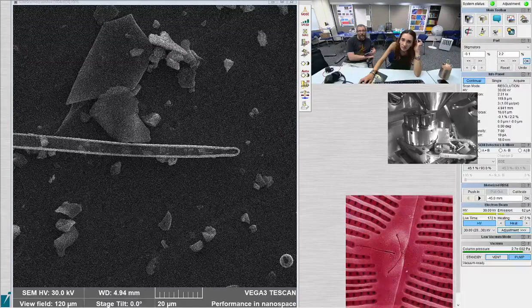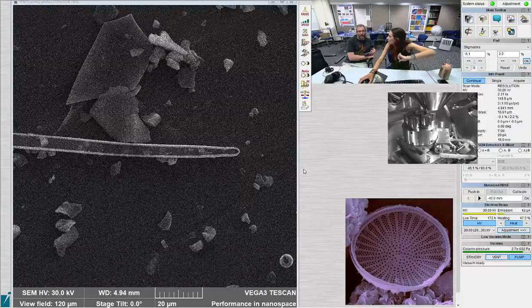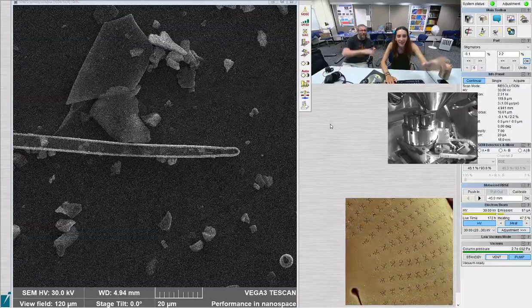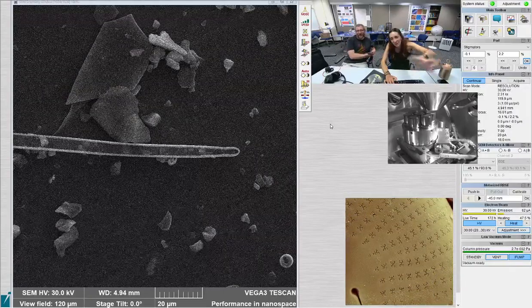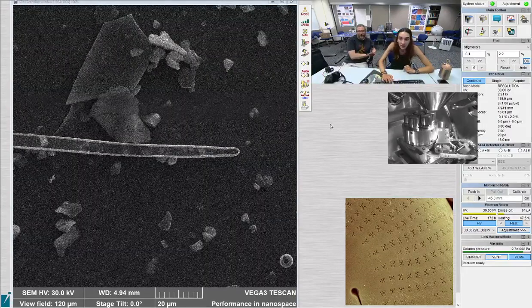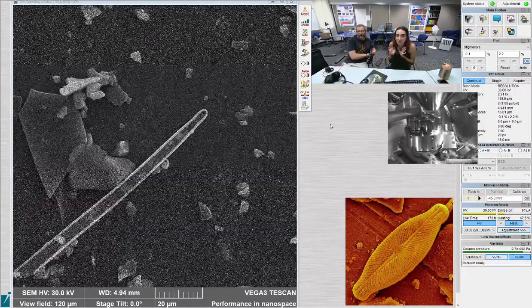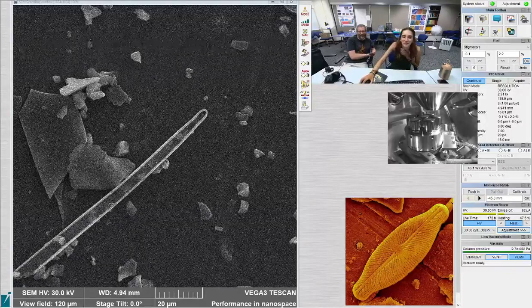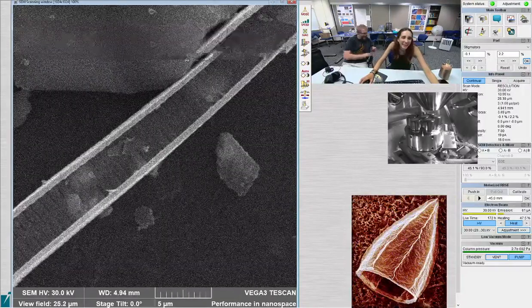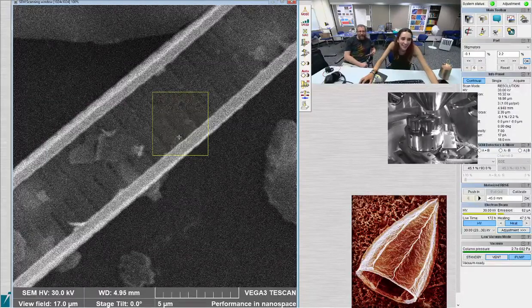You want to make it like, at 45 degrees. At 45? I was subtracting. Doesn't matter, you can also subtract it. It's just a matter of which corner it puts it in. From where you are now, it's 45 degrees. So I want to do 285, that will work. What happened? Okay, it's just thinking. Everything's good. Was I right? Yes. We don't need a boring math professor to help us with our math. We got it all figured out.